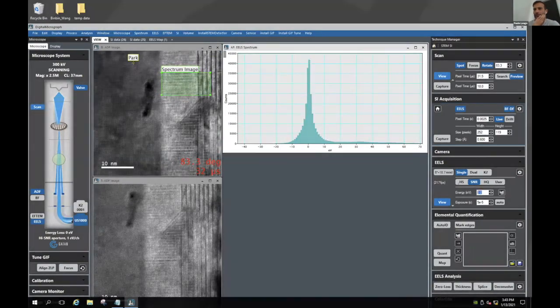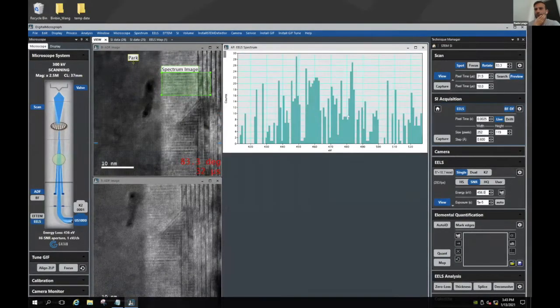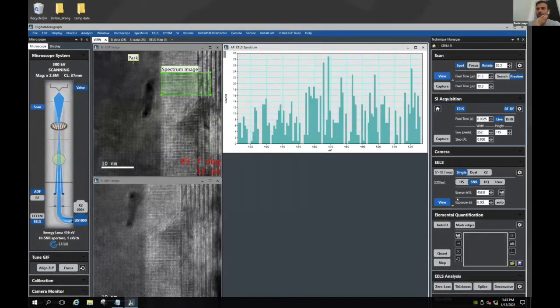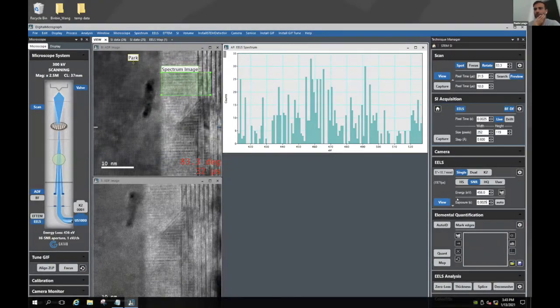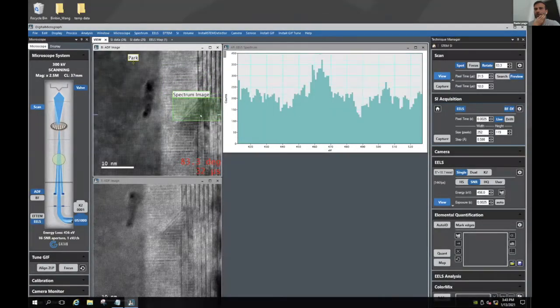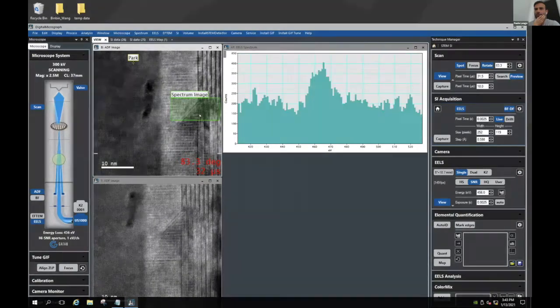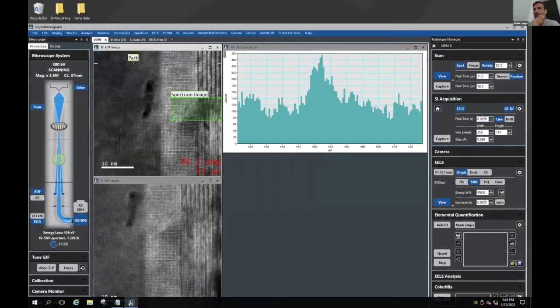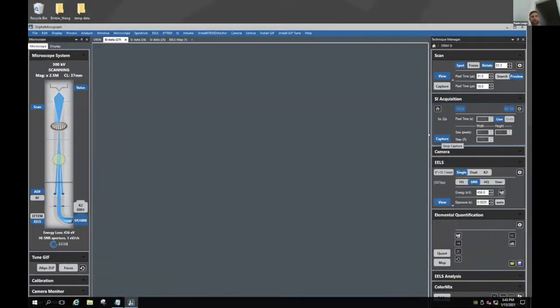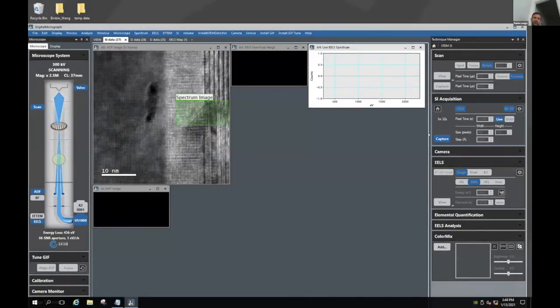Yeah, let's do the same thing. So let's switch to 456 like we did before. And now we use an exposure time of 0.0025. Let's try to go to the same area. I think we used this area here, if I remember correctly. And we're using the same conditions as before. It's going to capture. Didn't change the exposure time, didn't change the area.